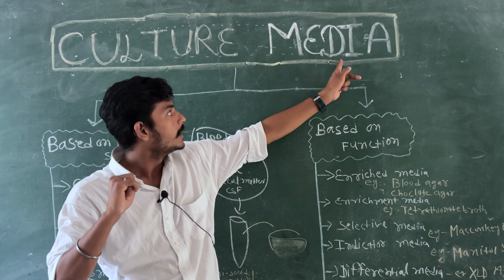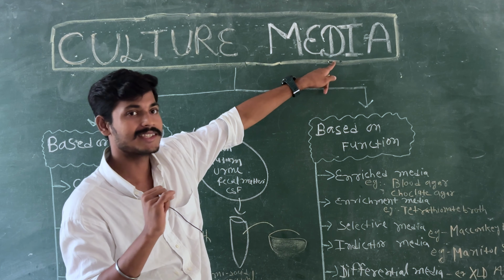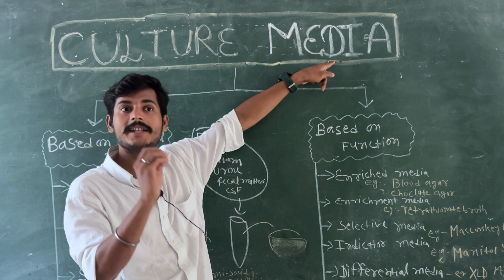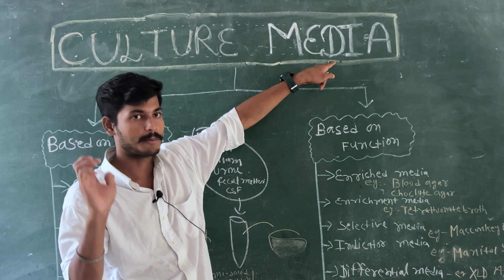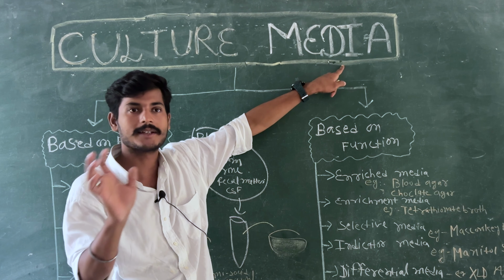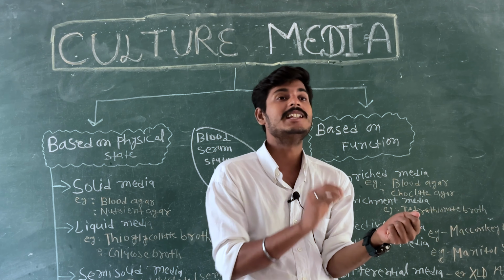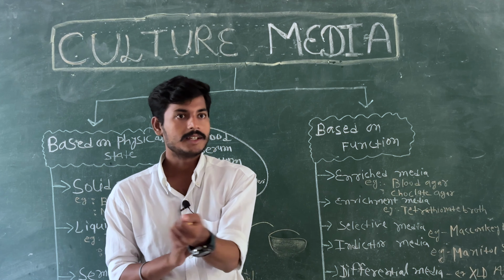Now another thing you have to keep in mind about culture media is that it is very crucial, very important for the laboratory. Without culture media, you cannot see the microbes. Because you will take a limited amount of blood, maybe 5 ml from any person.